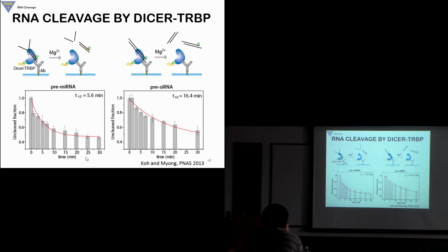We've done some of that, mostly proof of concept to see if this method is good for the filament forming proteins. But were you able to go backward and say, this one has 2 mismatches? Mismatches, yeah, not to that degree, unfortunately. But we are trying. These are very great questions. You guys are getting to the core of our research. It's great.